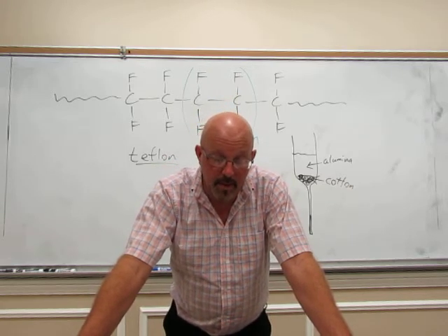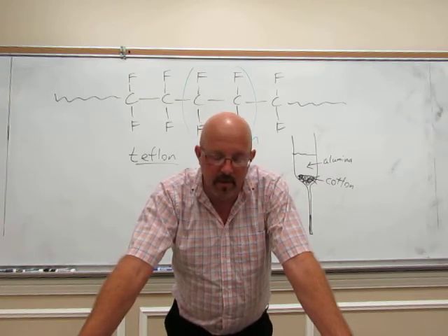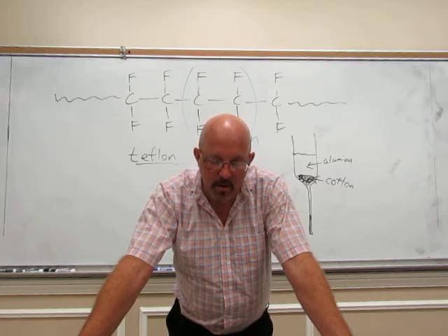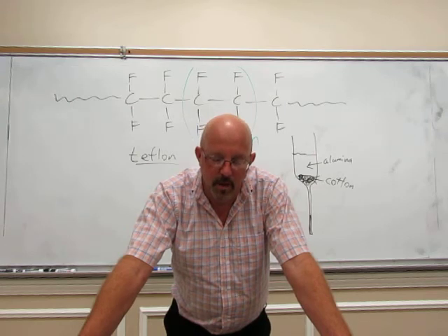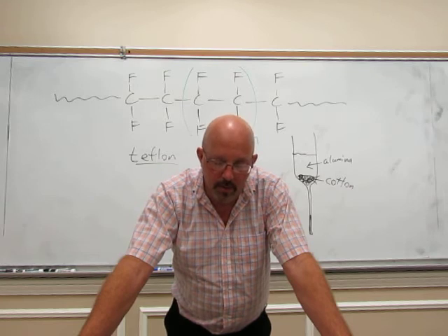Now, we've done this many times in the past, and oftentimes the polymer doesn't come out that easily. So if it doesn't, take it to your instructor, and we will take a hammer and break the disposable test tube. That's why we're using a disposable tube this week. We'll break the tube for you to get the polymer out.